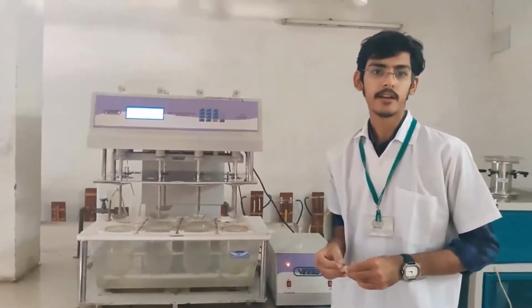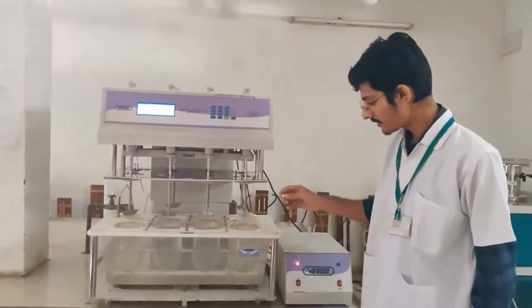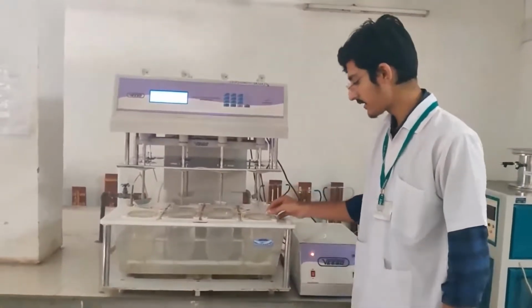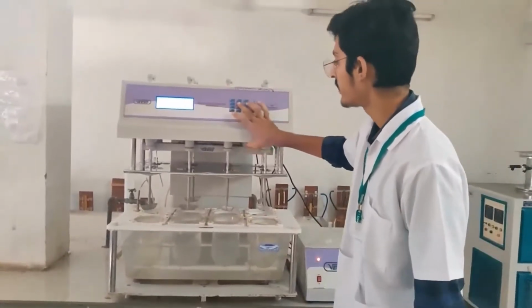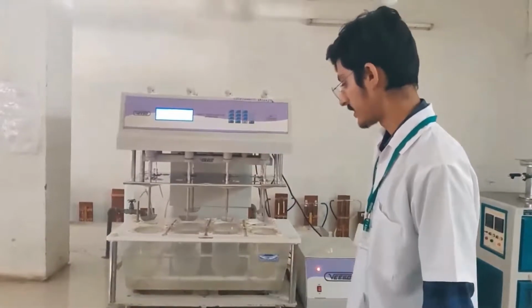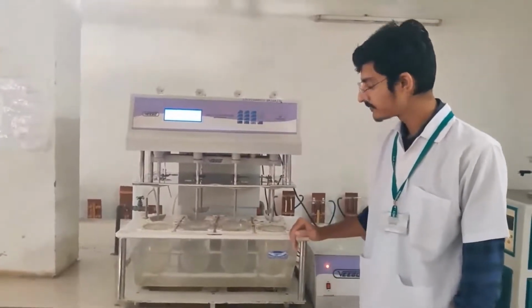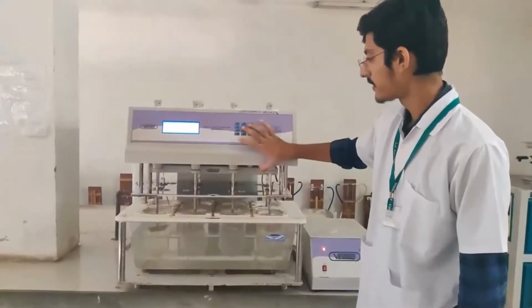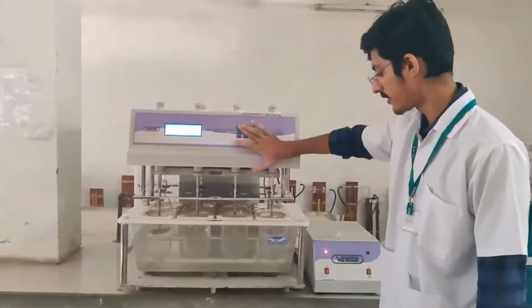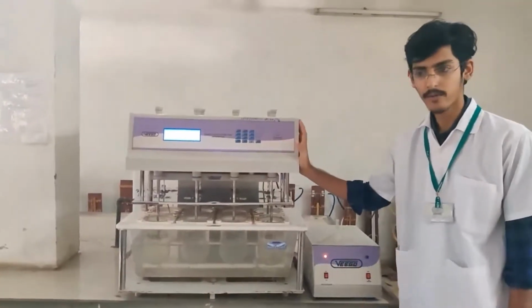Today, we will study the dissolution profile of this paracetamol tablet. First of all, we put our paracetamol tablet in the specified dissolution media. Immediately after, we will lower the platform by pressing the platform down button. After a certain level, we will switch the stirrer on and set the RPM according to the given specification.